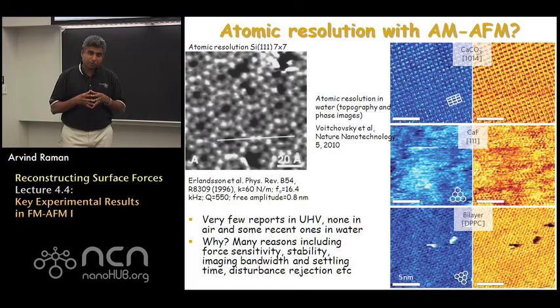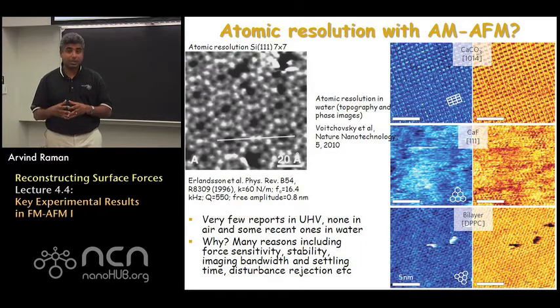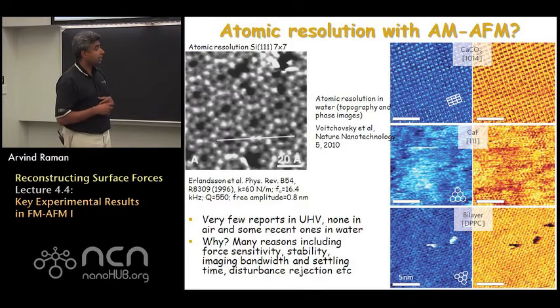So there are a few reports on the use of tapping mode AFM for atomic resolution in vacuum, but none in air. And more recently, there have been results coming out on the use of tapping mode AFM for atomic resolution in liquid environments, as shown in the study on the right. So this brings up an interesting issue. Why is it hard to get atomic resolution with tapping mode?